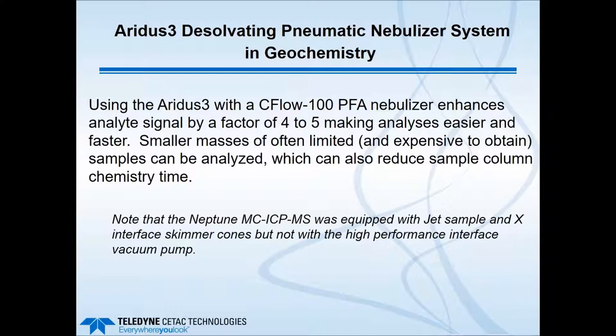In this experiment of note, I'll mention that the Neptune multi-collector that was used was equipped with a jet sample and X-interface cones, but unfortunately the high-performance interface vacuum pump was down and not working. So we did very, very well even despite that. Perhaps in the future we might be able to look at experiments once this pump is fixed and may be able to, of course, get even greater analyte sensitivity improvement.